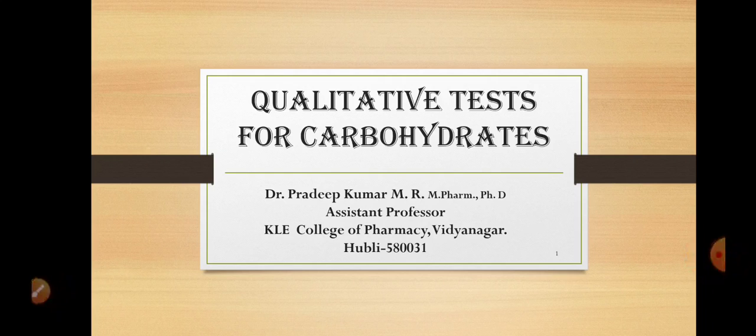In this, I will be discussing the qualitative tests carried out for identifying the carbohydrates. Before I start, I just want to give the definition and the classification of the carbohydrates. Then I will continue with the different qualitative tests carried out for identifying the carbohydrates.